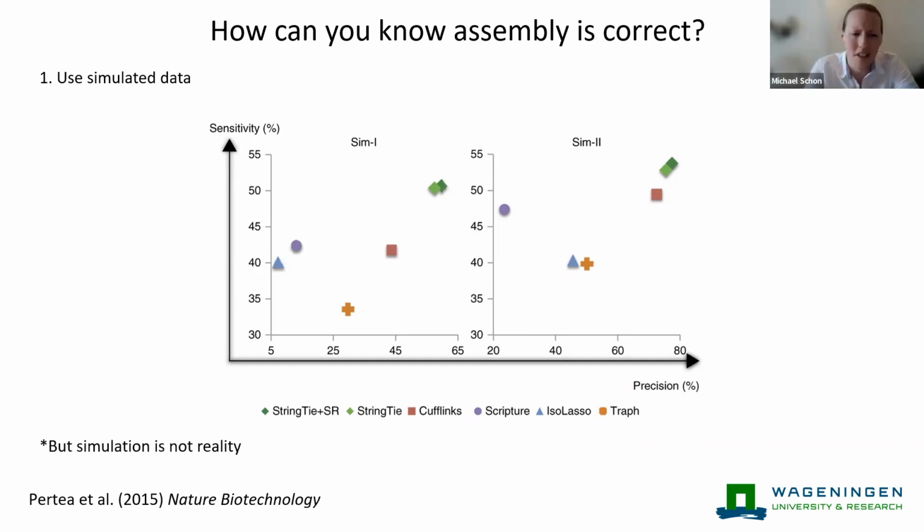But unfortunately, simulation is not reality, and there are a lot of things that happen in the actual chemistry of reverse transcription, of generating the sequencing library, that introduce different biases and errors that you can't fully account for through simulation.